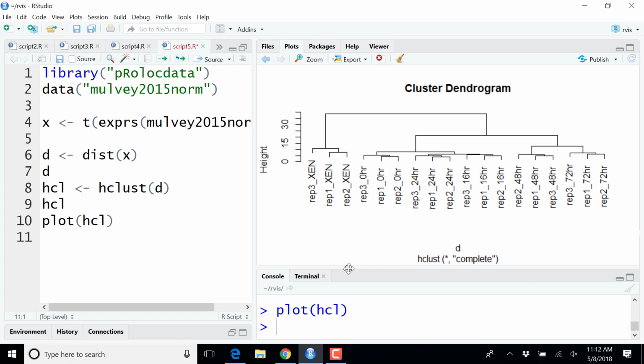Whereas within these subclusters, the distances are much smaller. So even if here we would have some scrambling of our time points, that wouldn't be a problem because the distances are small anyway. A little bit of noise, a little bit of variability wouldn't be a problem at all.